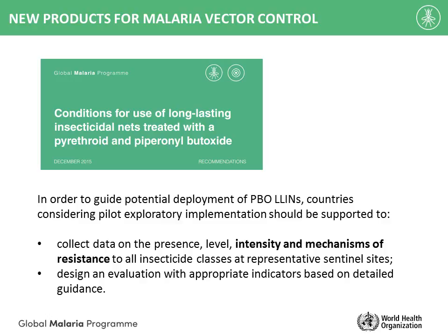One of the recommendations was for countries to collect data on the presence, level, intensity, and mechanisms of resistance to all insecticide classes. In order to facilitate the collection of these relevant and important data for countries, the update of the test procedure was then proposed.